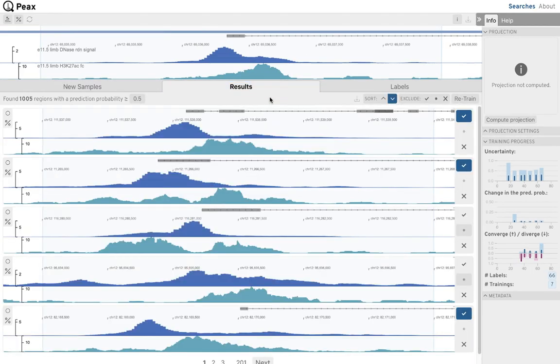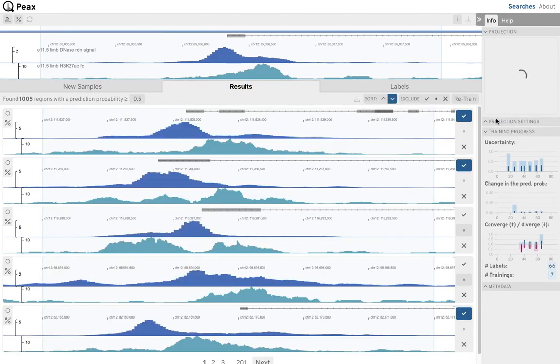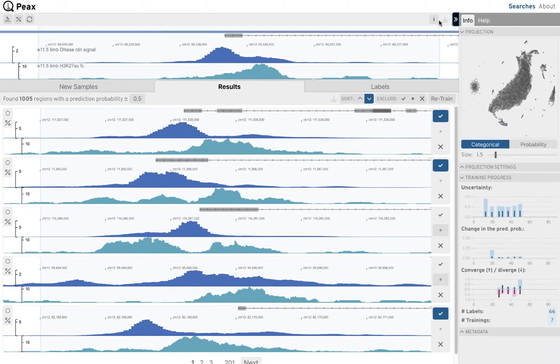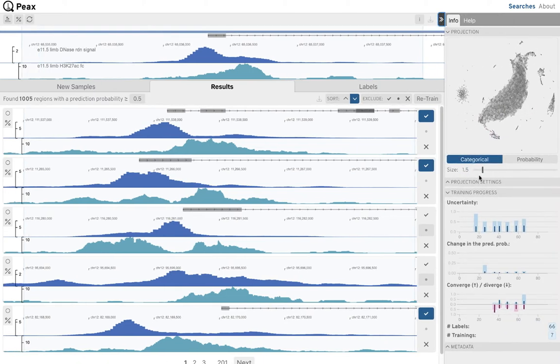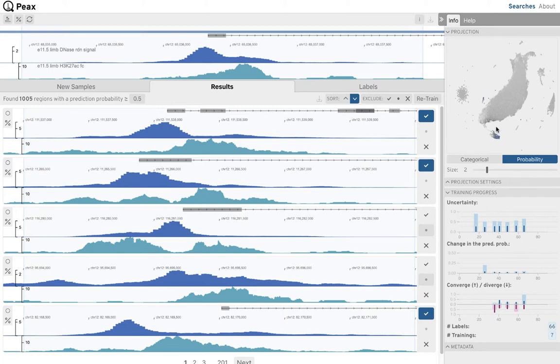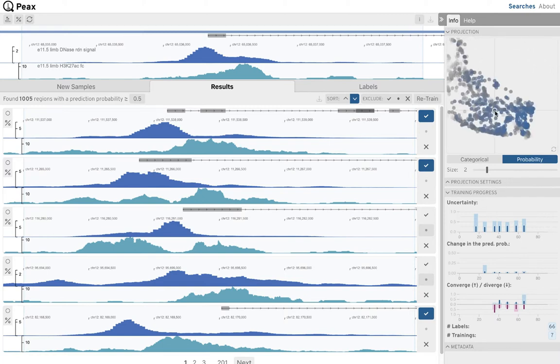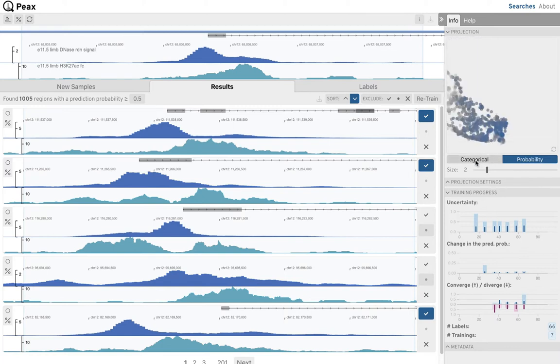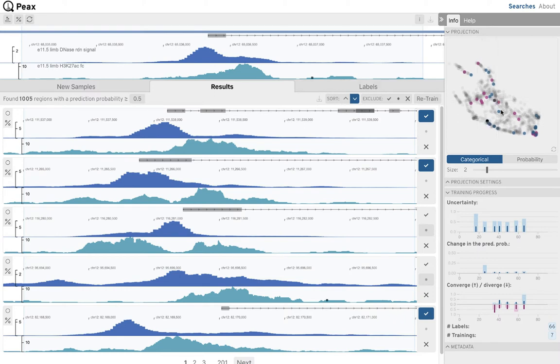After having labeled 66 regions, we decide to gain an overview of all regions for which we compute a UMAP embedding that is visualized in the embedding view. We switch to the prediction probability color map and see two neighborhoods with potential matches. Through brief exploration, we find that most of the regions we labeled so far are scattered throughout these two neighborhoods.